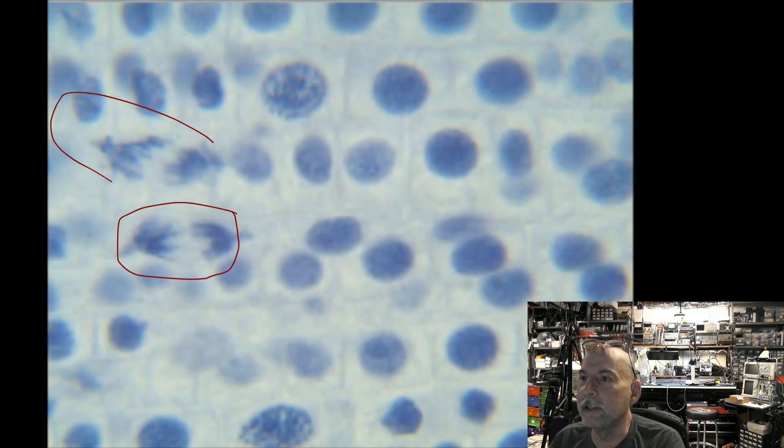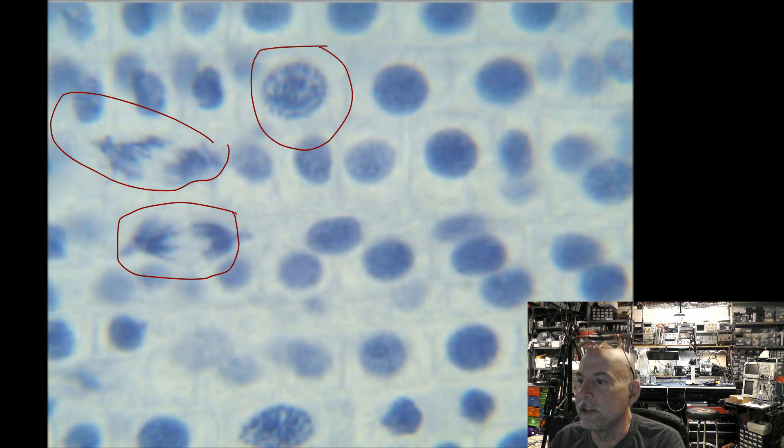Here we have active replication going here and here, this one's getting ready, this one's getting ready here. As you saw, it was a lot touchier trying to get the actual camera to see what I could see through the eyepieces — a lot of it's intuitive. You're adjusting the focus on the fly because your subject matter really is three-dimensional. At these magnifications, you have to focus through something; even into the cell you could see it focusing deeper and less deep. But there were some great shots of the anaphase, prophase, and metaphase — the various portions of the mitosis. Bill Hurd from Hackaday — they weren't the greatest shots, but it helped kill an afternoon and I got to do some science. Catch me on the next one.